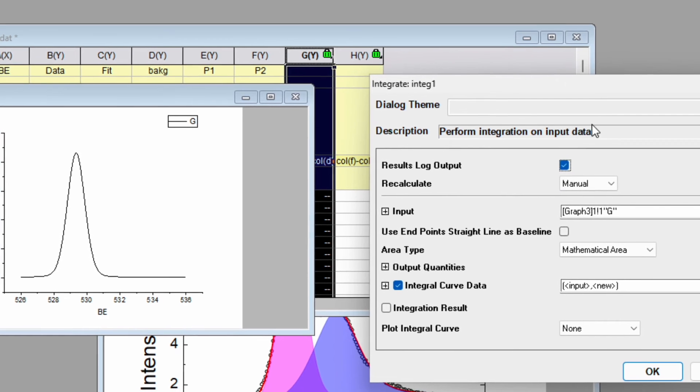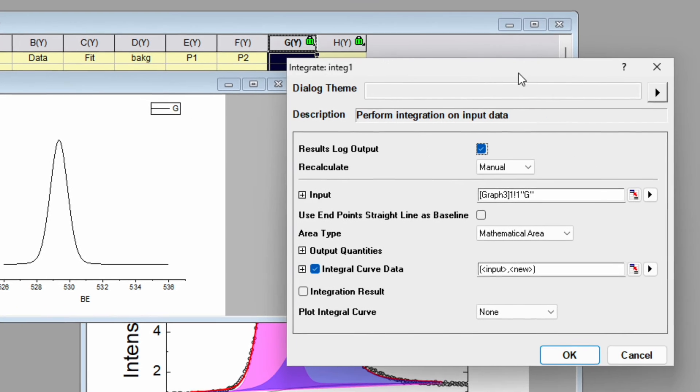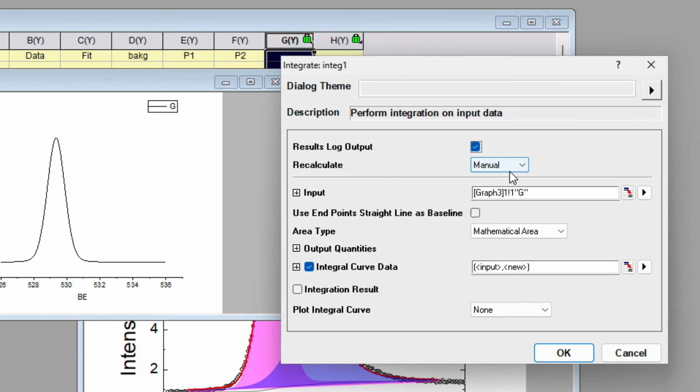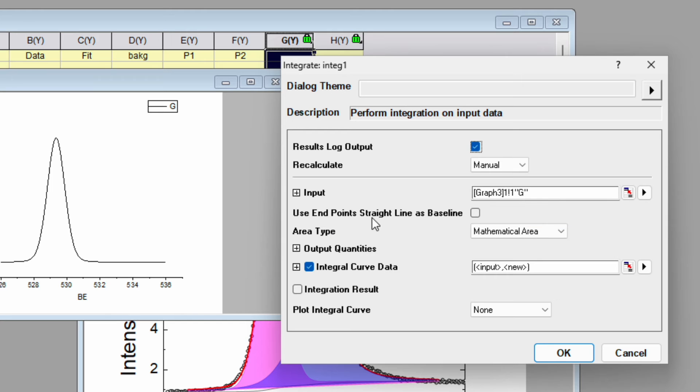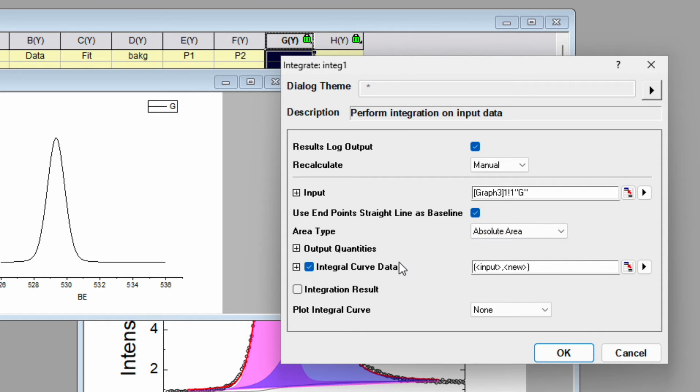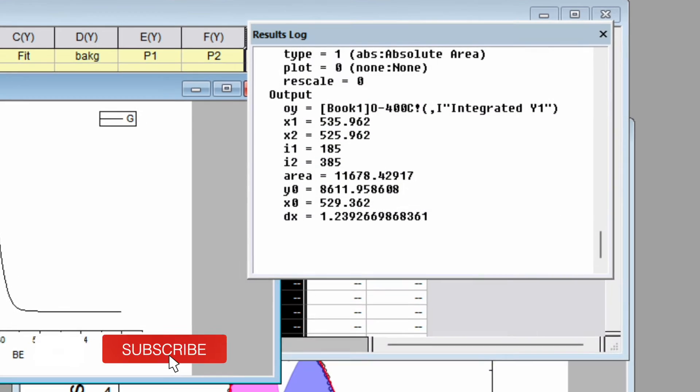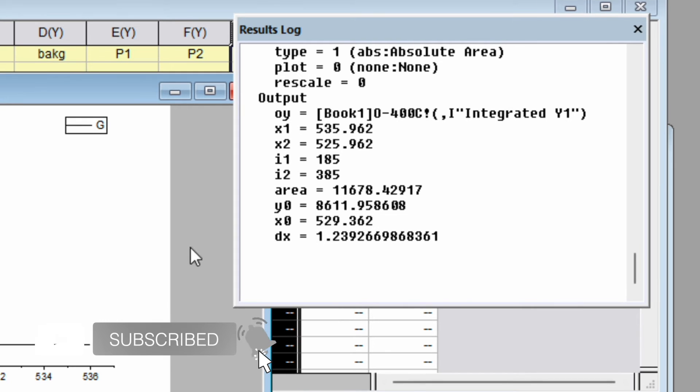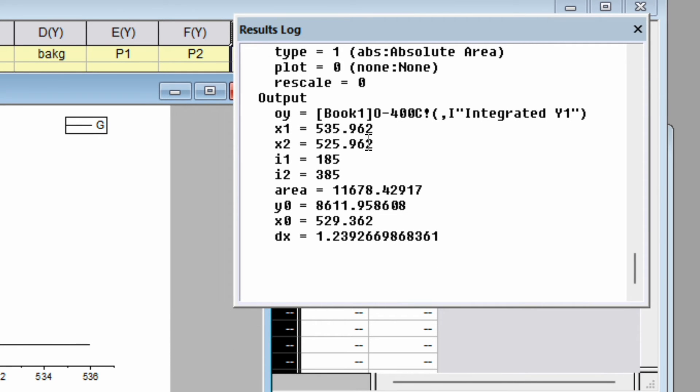In the open dialogue it will show Results Log Output, Recalculate, Manual Input. Use endpoint straight line as a baseline, click yes, check this box. Then for area type, instead of mathematical area choose absolute area. Keep all things as it is and click OK. It will automatically perform the integration and the area under the curve is 11678. Do the same for the second peak.